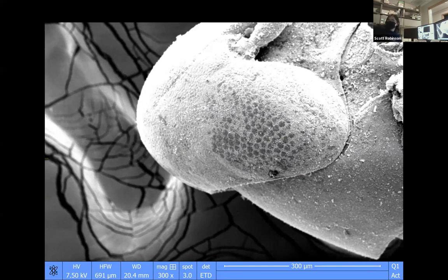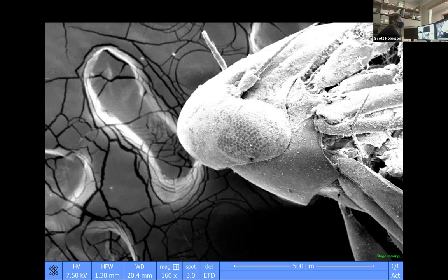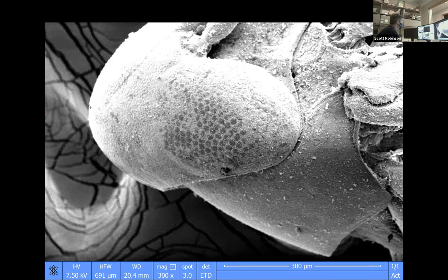Okay, so I'm going to come over here. This is really cool. So we're looking at, it's a little bit hard to see what we're looking at. It looks just like a little mess. We're going to hit the contrast and brightness and see if we can adjust those a little bit. They're underneath the zoom bar, so it's a little bit tricky. But what we'll do is bring the magnification up on this. And what you see is a whole bunch of little dots. They look kind of like eye facets. It's hard to tell what they are. So we're going to bring the mag up a little bit.